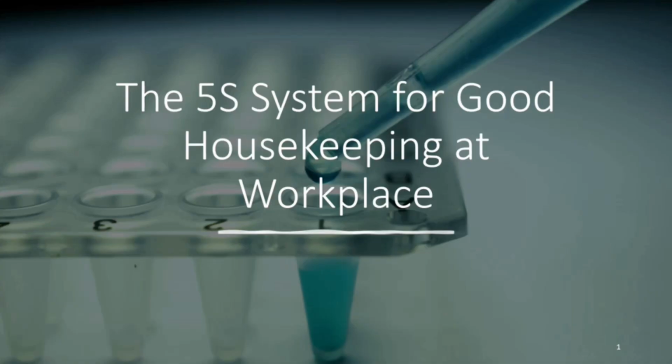In this video segment, we are going to learn about the 5S system for good housekeeping at workplace.